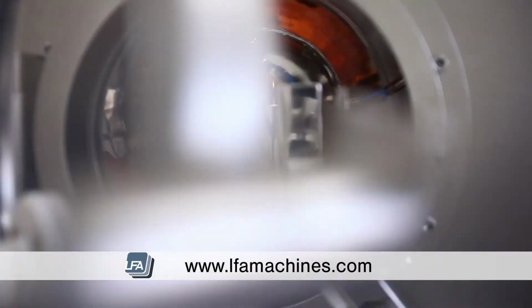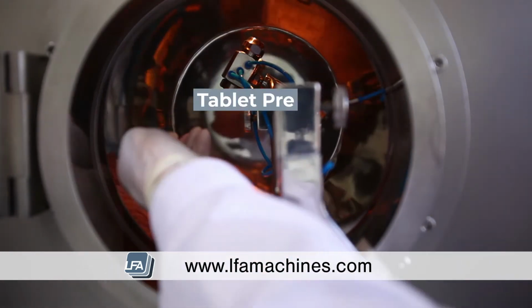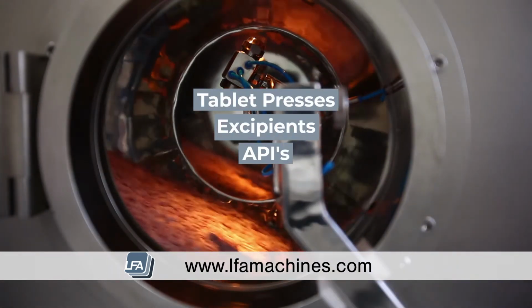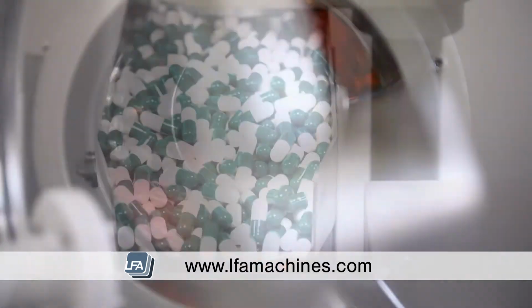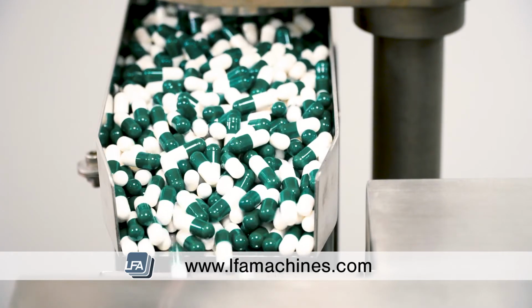In general, tableting is harder to learn, as creating formulations requires a lot of learning about tablet presses, excipients, APIs, and how they all react with each other. Encapsulation is considered easier to learn, as the formulations are not required to bind and eject.